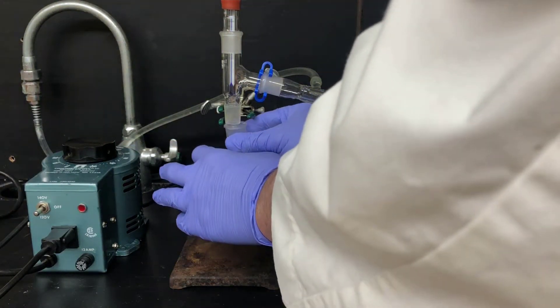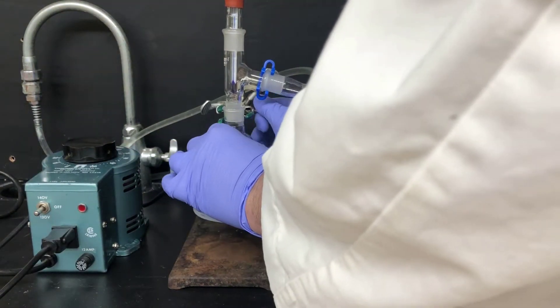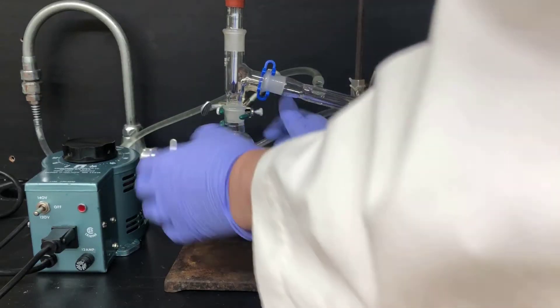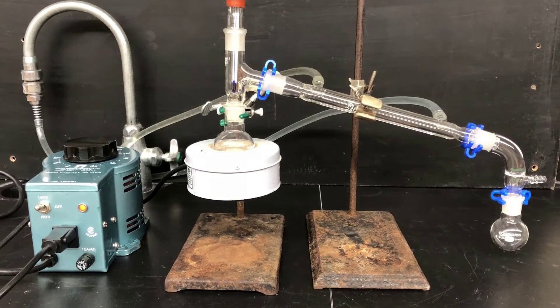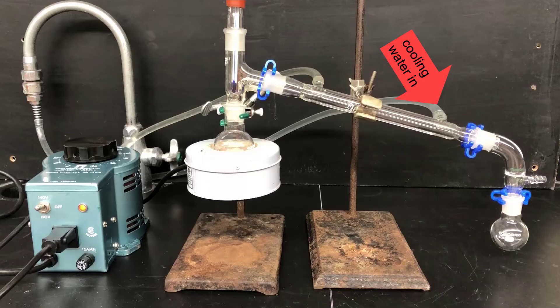Next I'll attach the flask with propanol to the distillation apparatus and distill the propanol. I've covered distillation pretty extensively in other videos, so I won't go into great detail here, but I'll point out a few important things. First, make sure your joints on the distillation apparatus are snug or you could lose vapor. Second, cooling water should go in through the bottom port of the condenser and out through the top — be sure you turn on the cooling water.